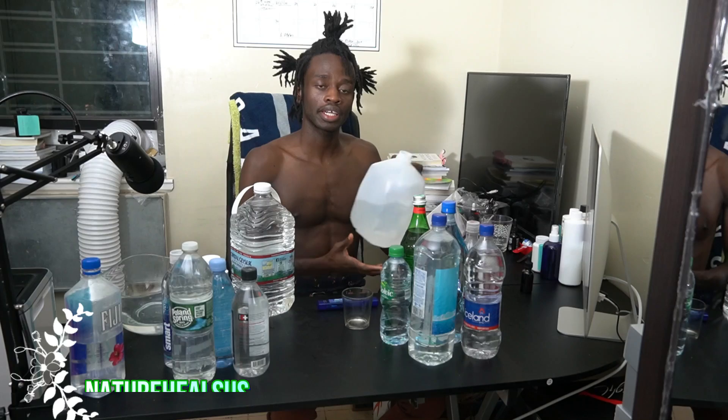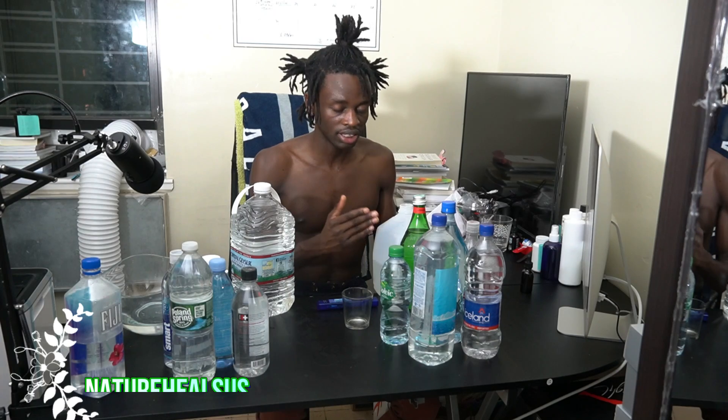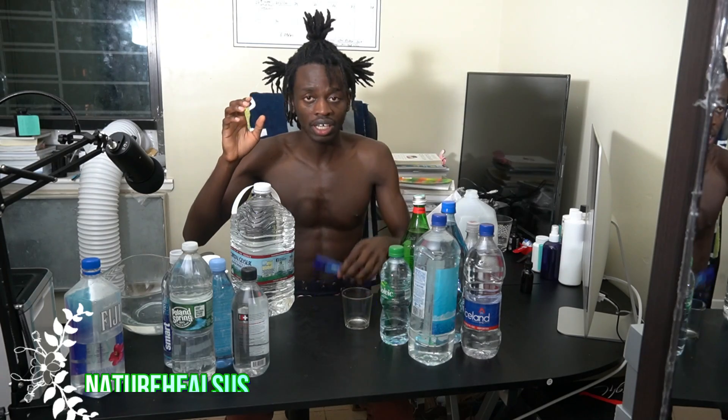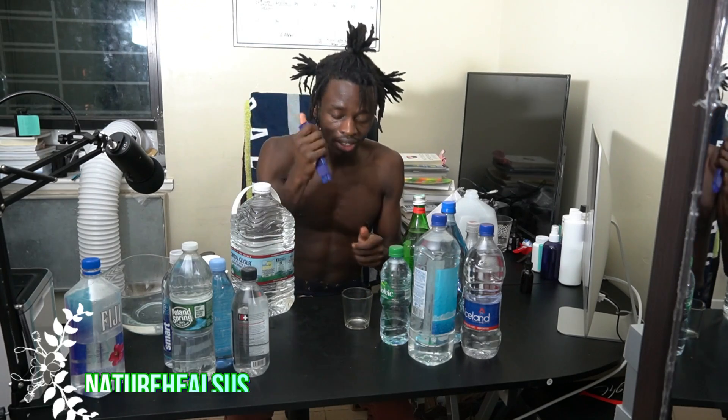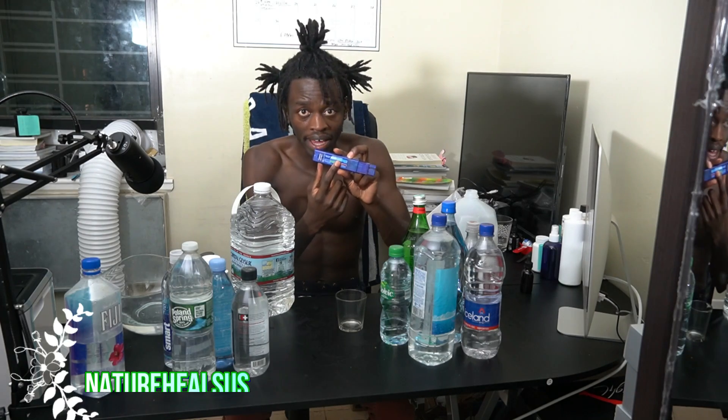I have the distilled water right here and I'm going to be using it as my neutral base between all of these waters. I'm not doing all of them, but you guys can do this at home as well. Buy whatever spring water you want, get yourself a TDS meter, test it, and look at the back. You'll understand if it's bad or good for you.